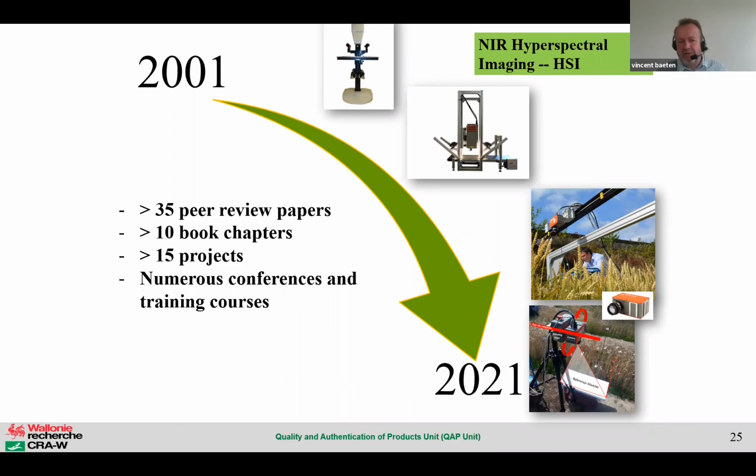In our facility, we started, as I told you, several years ago. What's nice is that we took the challenge a few years ago to bring our instruments to the field also. And there we met our colleagues in our institute who are working with spatial analysis, and then they came with the drone. But in fact, we are coming from the lab. So we try to be sure that the answer of the instrument, the spectroscopic information, is there, and we work in very specific conditions in order to be sure that we will be able to get good spectra. And that's very amazing. We have to mention here that Belgium, with IMEC in Leuven, is quite well placed in this sector because they developed a very nice sensor. In the future, it's fantastic when you see what they are doing and what they will do. And that's where we go.